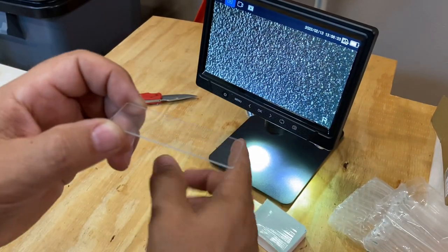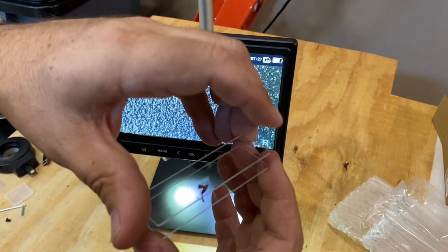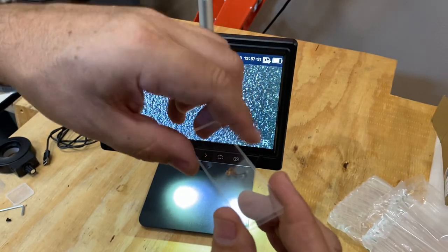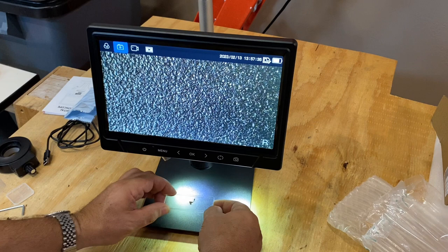Let's go ahead and use them with my microscope here and take a look. I've got a specimen that I would like to look at and put it in between two slides. There we go, and then bring that into view under my microscope.